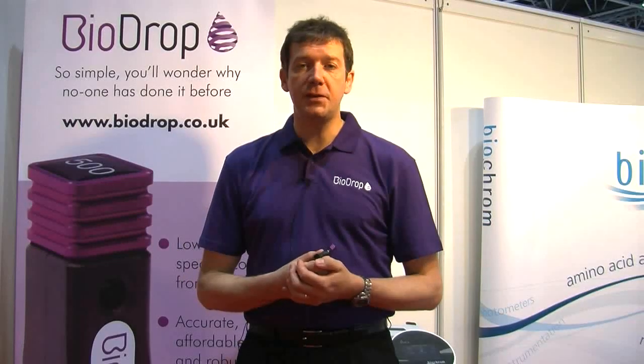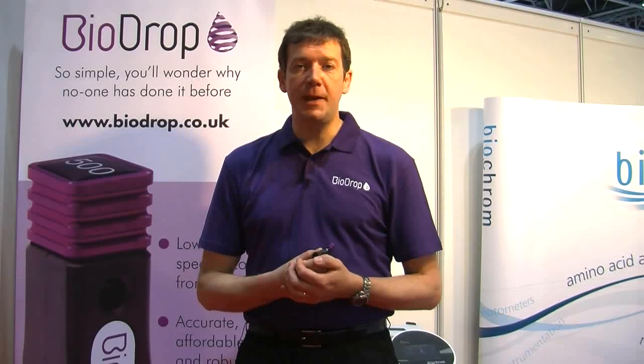So that's it — BioDrop, a revolutionary product on the market as of yesterday, and we'll be shipping them in early April.